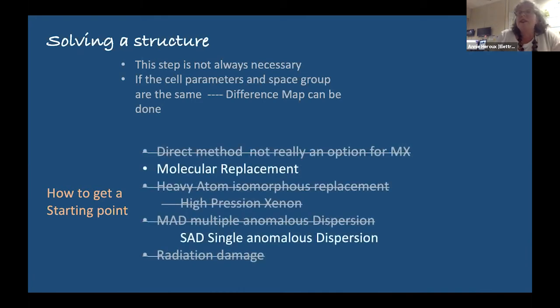In practice, at the synchrotron, there are two methods that are the favorites. Not that the other methods are bad. It's just some of them require a lot more wet lab, and some of them are extremely difficult to handle crystallography speaking. At this point, these methods work great.